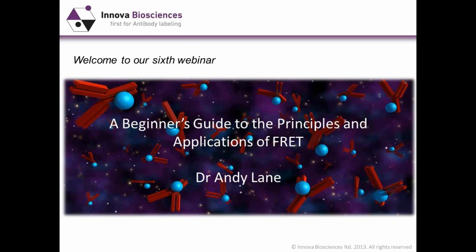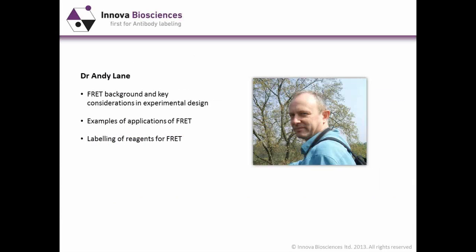Great. So our speaker today is Dr. Andy Lane. He will introduce you to the basics of FRET and its applications, which range from the construction of so-called tandem dyes to increase the range of reagents suitable for use in flow cytometry, to assays designed to identify molecular interactions as part of drug discovery research programs.